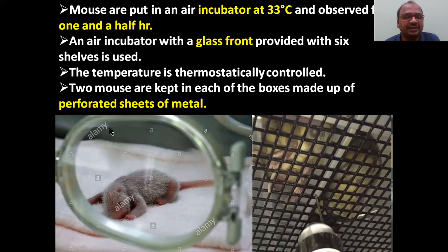And an air incubator. This is the incubator. Inside, I kept the mice here. This is an incubator with a glass front only, which you have to take. The glass front is provided with 6 shelves, and each shelf bottom should be a perforated plate. Six shelves must be there. That point you have to keep in your mind.